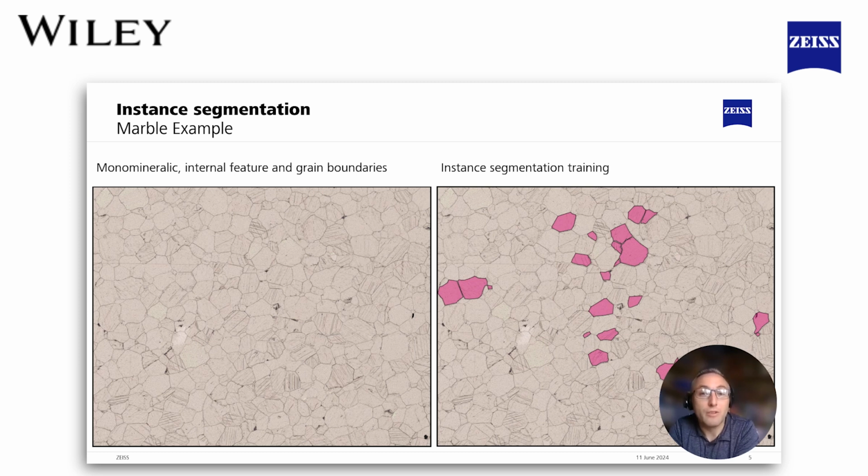So you can see here, 10, 15, 20 grains going around, picking up some of the variation in size. And I've gone through this sample and highlighted, this is what grains look like. By selecting the area here, it's telling the software this is what the sizes and shapes of the grains typically are, but also that anything inside that area is a natural part of the variation within a grain, whereas anything outside that area represents what the grain boundaries look like.